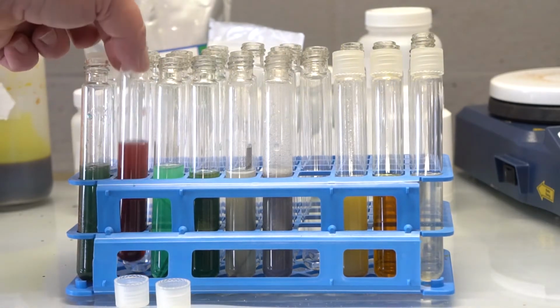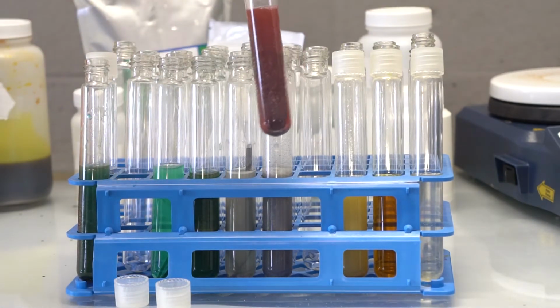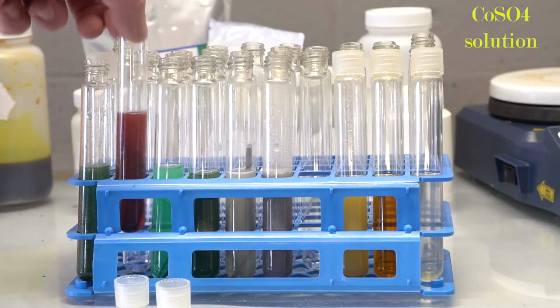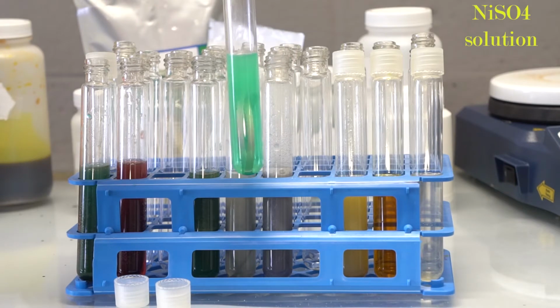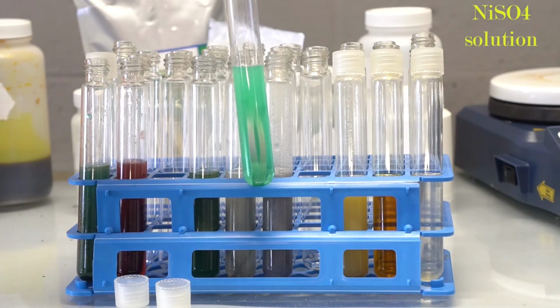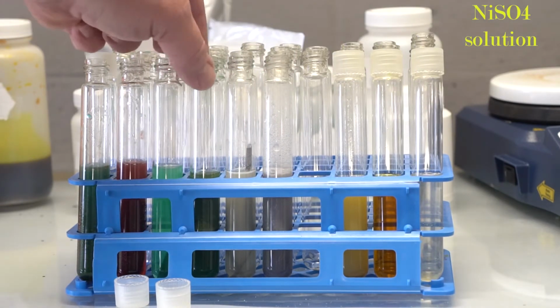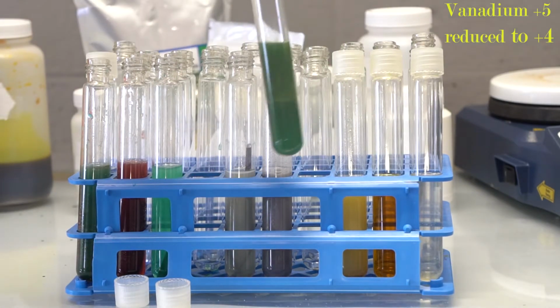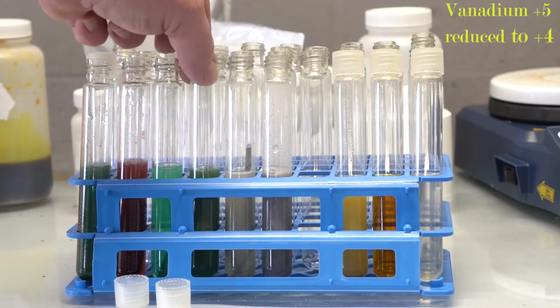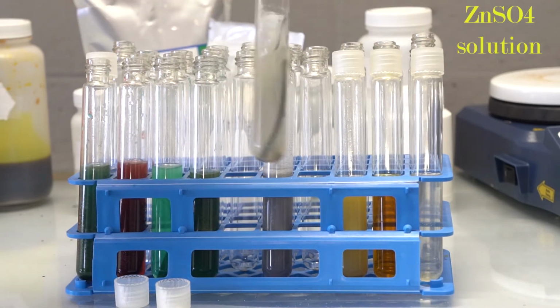Looking at the standard reduction potential table on the ChemTalk website, I saw that magnesium being oxidized to the +2 state has an oxidation potential of 2.37 volts, which means that it is a much stronger reducing agent than any metal other than the other alkaline earth metals. So I was really excited to see how these 16 reactions went.